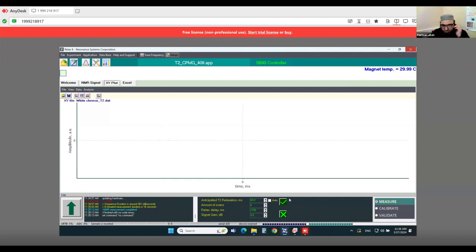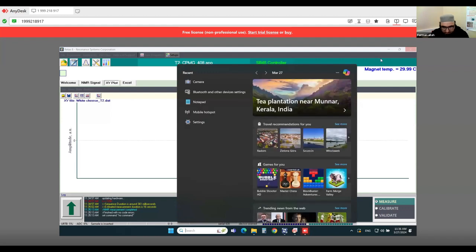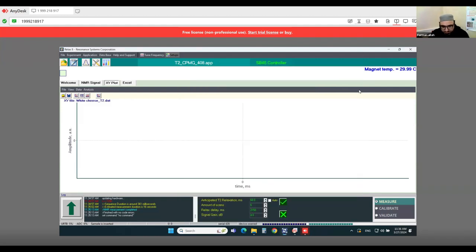So I will request my colleague to change the sample. Okay, I changed it. It's ready to measure.